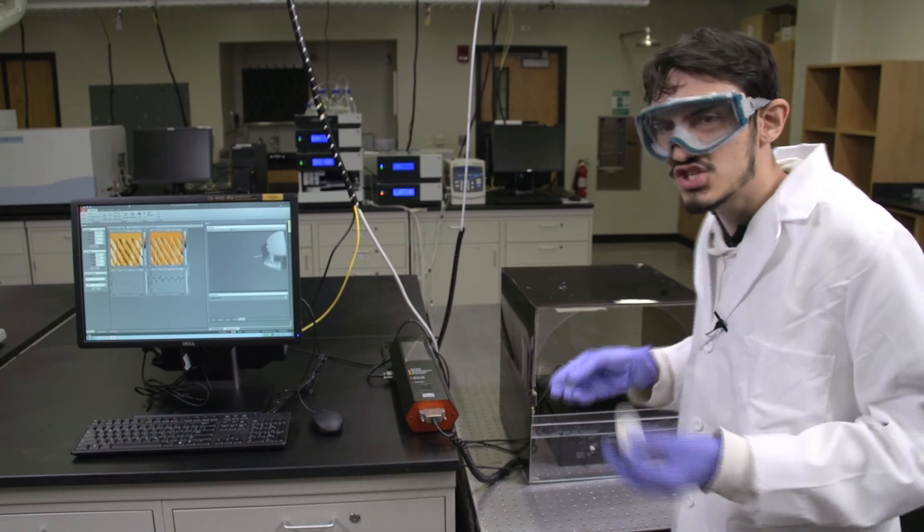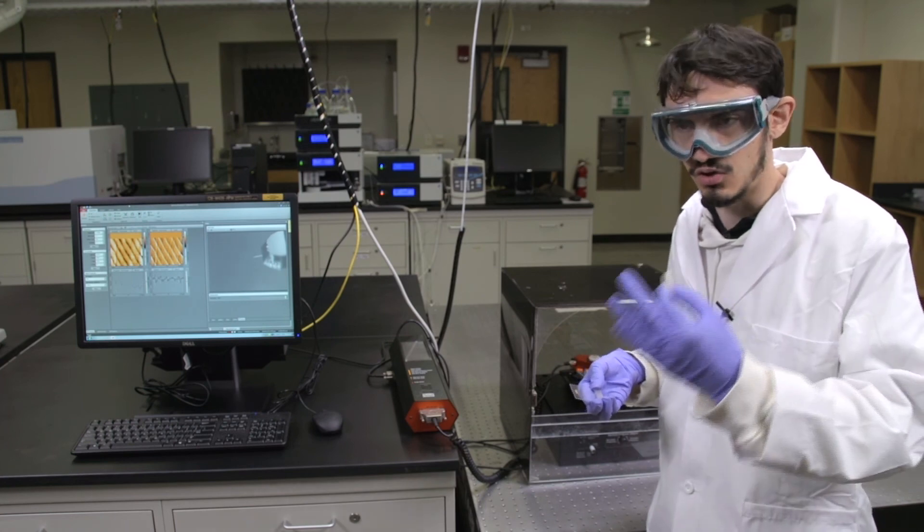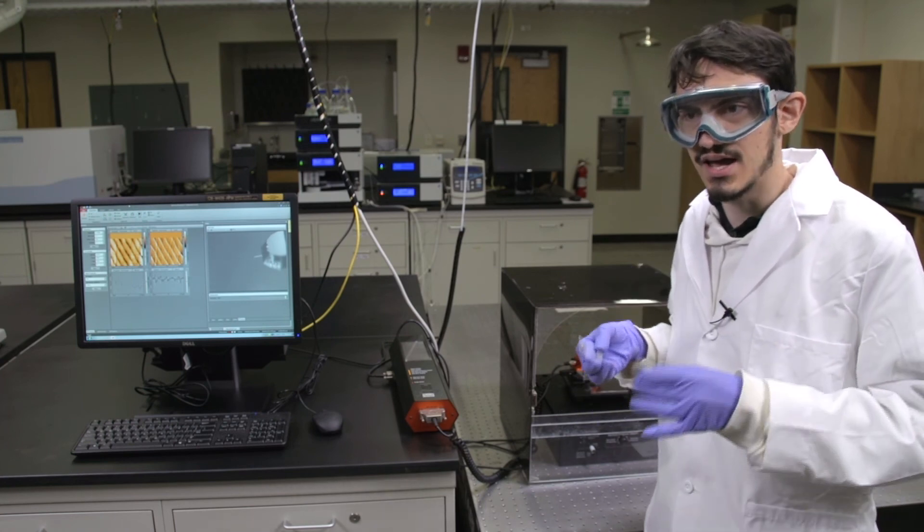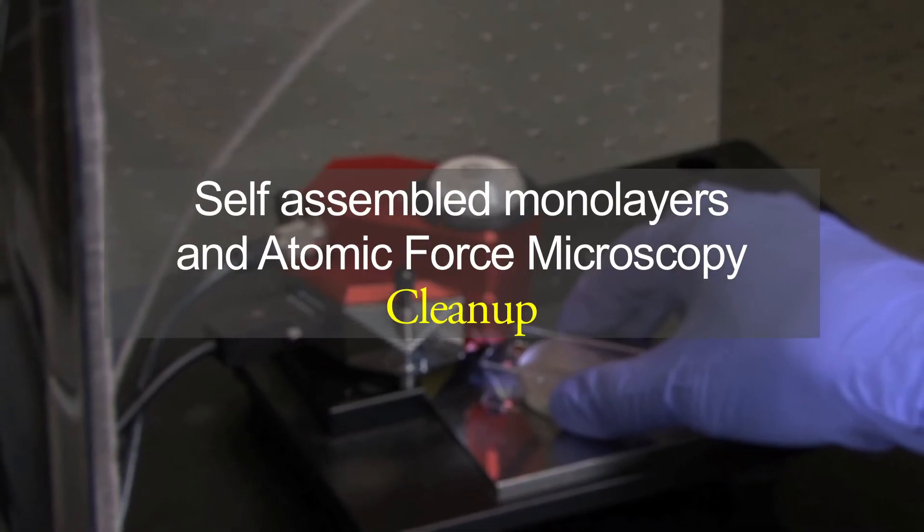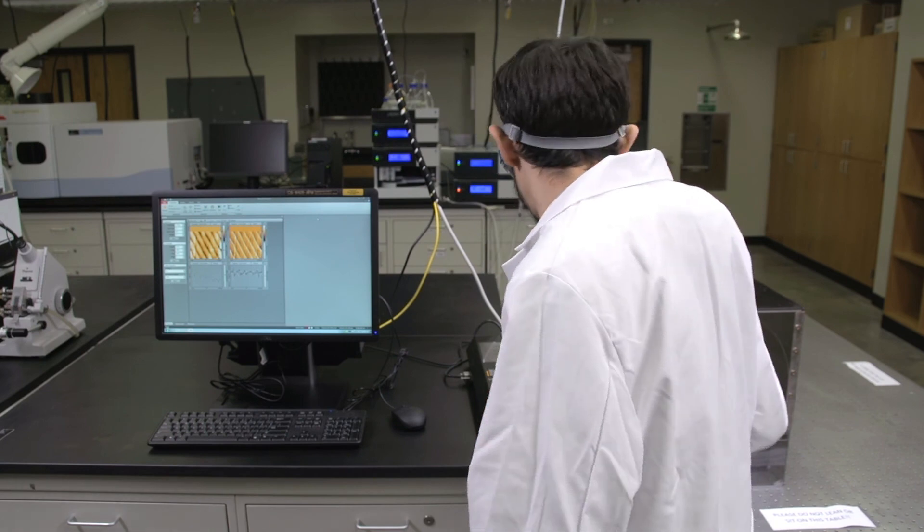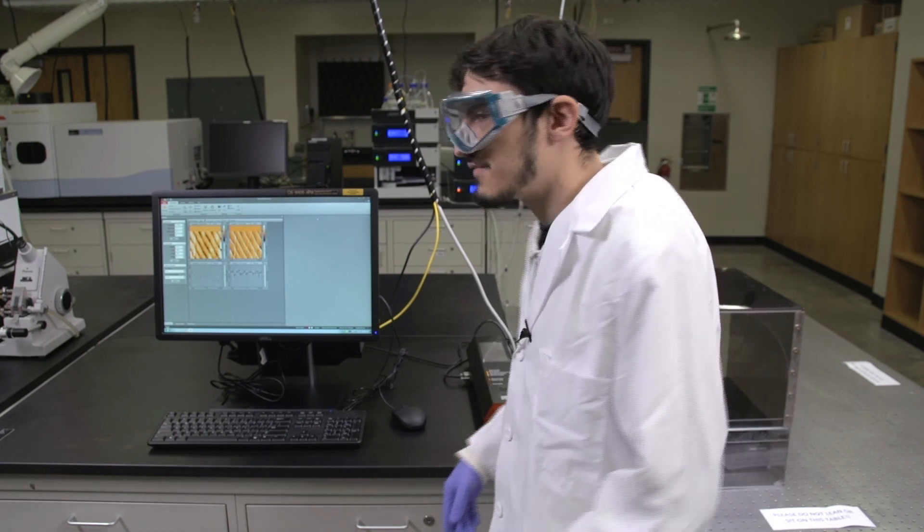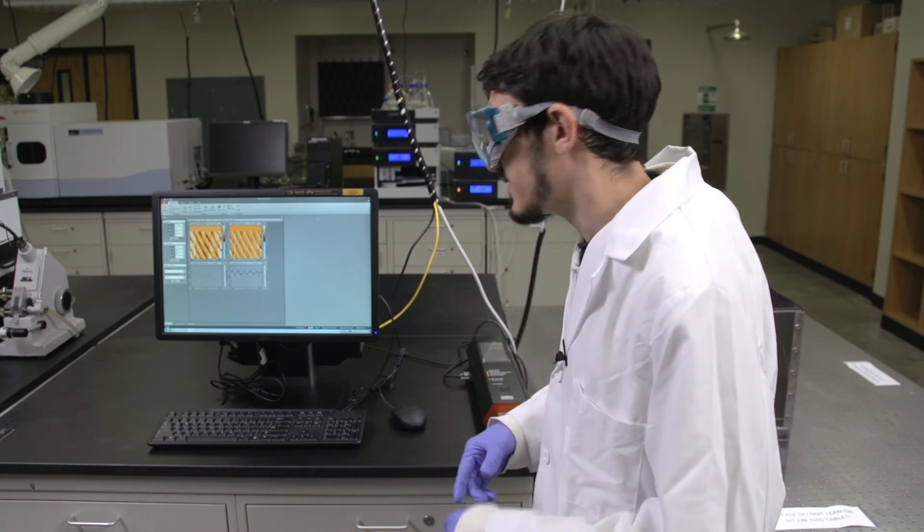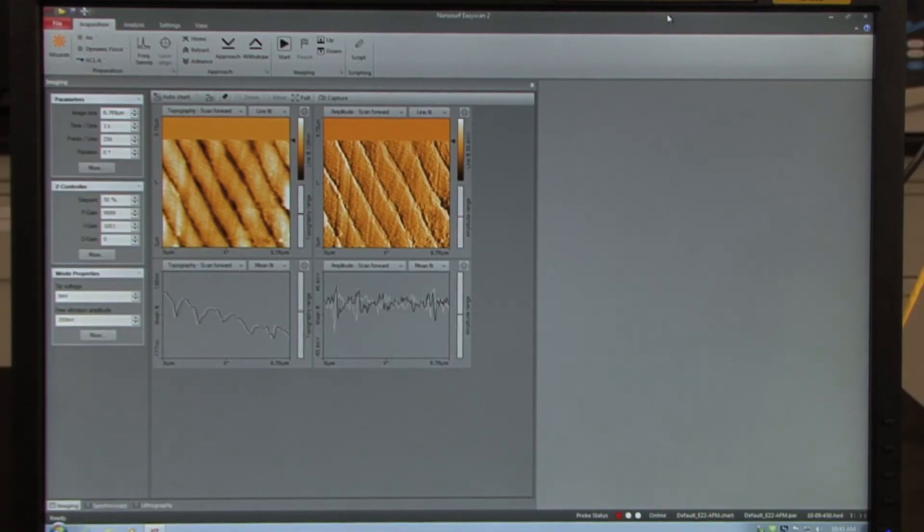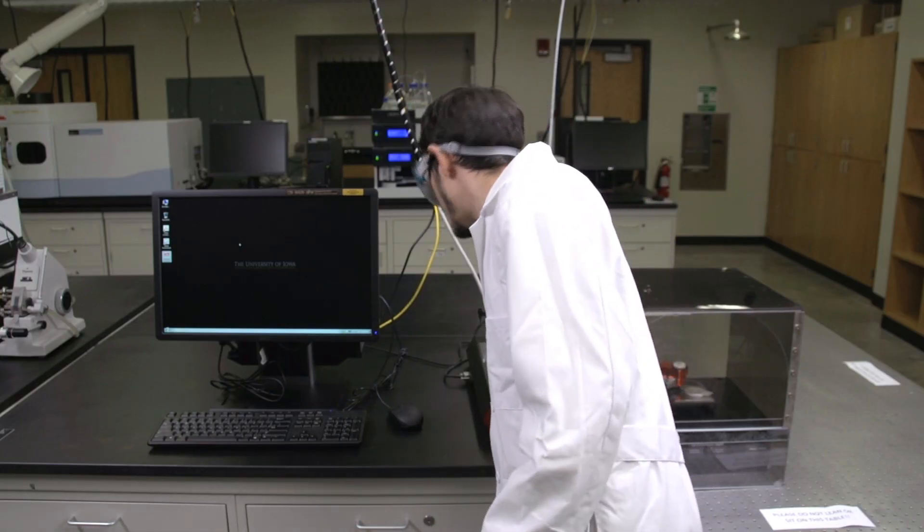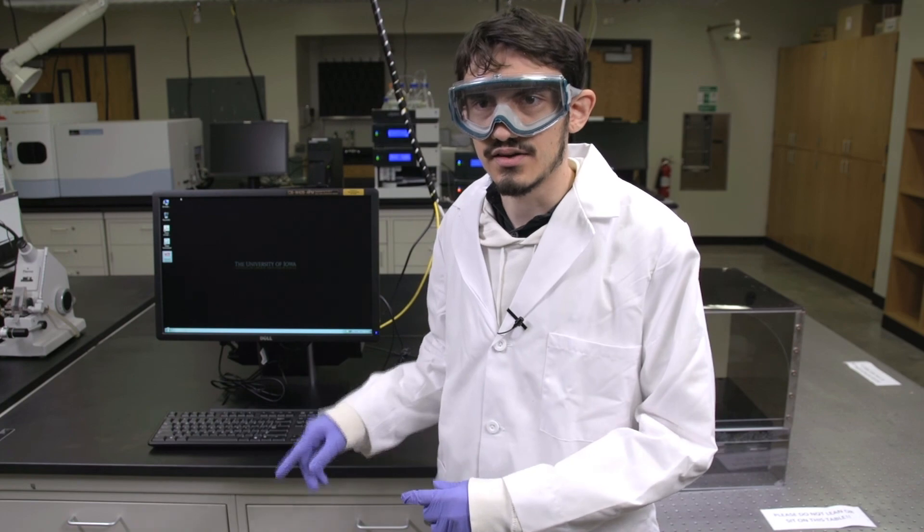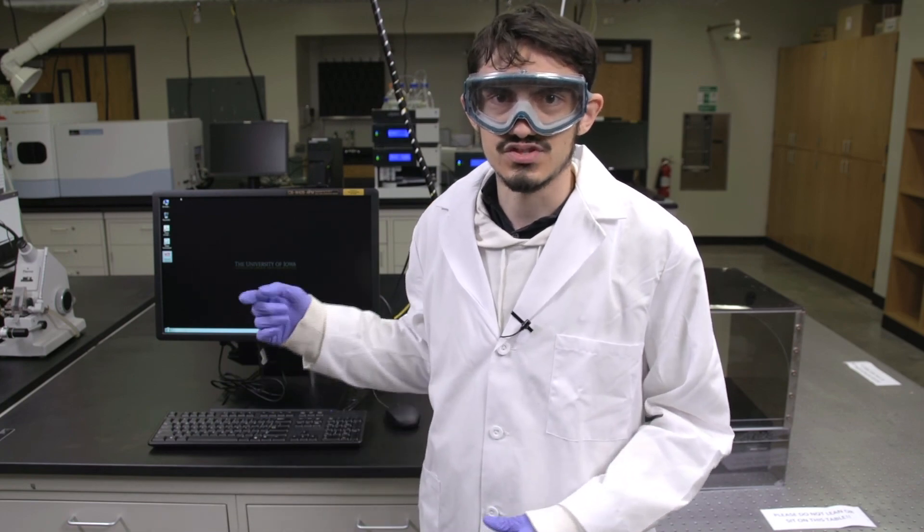Repeat this process for each of the alkane thiols. You'll want to be sure to start with the longest of the alkane thiols as it's easier to image and it will enable you to get enough practice for the remainder. When you're done with all your measurements and you've completely retracted the AFM head from the glass slides, you'll want to exit out of the software first and then turn off the power unit for the instrument. Make sure each member of the group at the very end logs on and saves the files to their individual H drives.